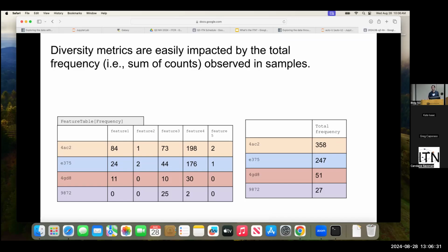You might come to the conclusion that there's more plant diversity in the desert than in the rainforest, because you put a lot more effort into looking for plants in the desert. So what you really need to do is normalize that sampling effort across all of your samples. If you do that, then you should expect to see something more reflective of reality.